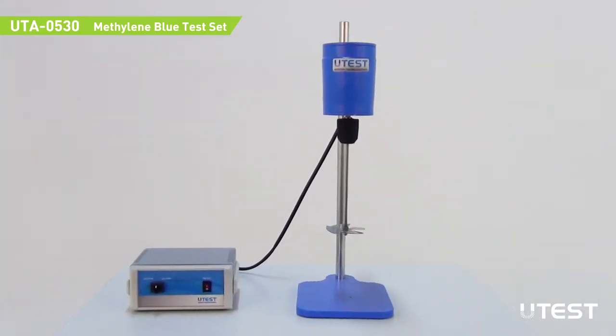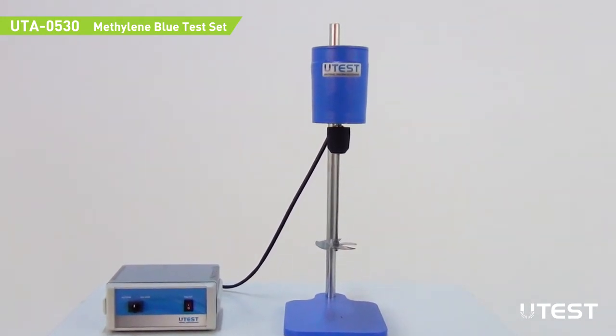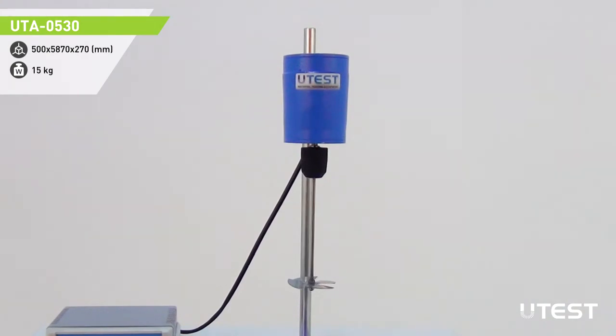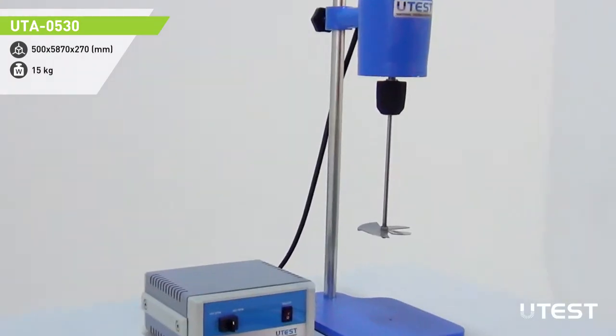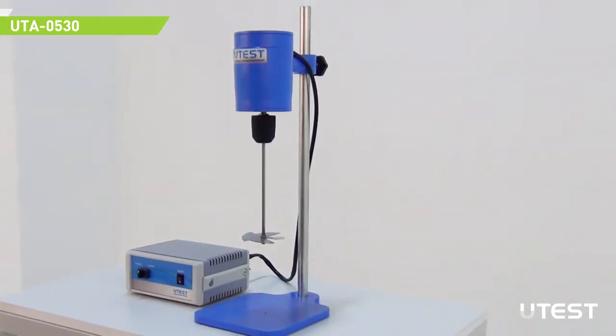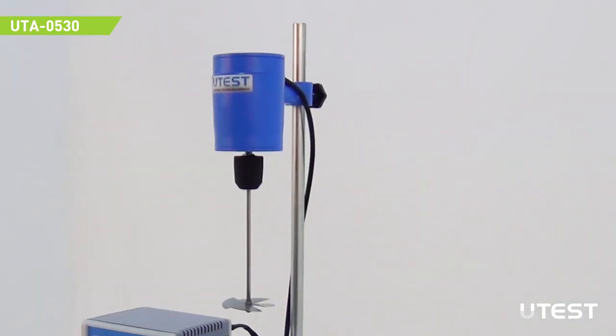Set consists of a stirrer which has two adjustable speeds of 400 and 600 RPM. The motor is electronically operated by a microprocessor. A stirring propeller is placed at the tip of the rotating shaft. The stirrer is fixed on a support base that allows height adjustment.